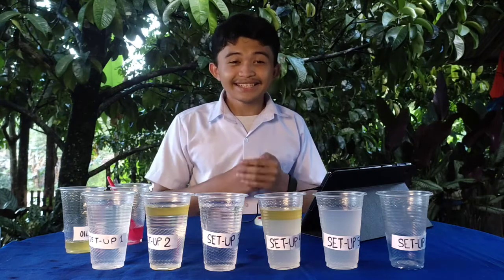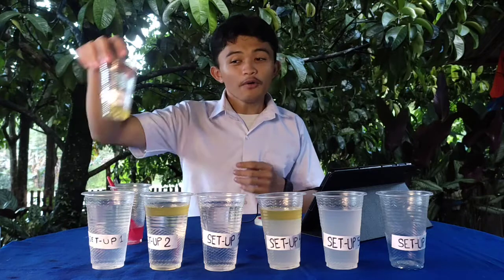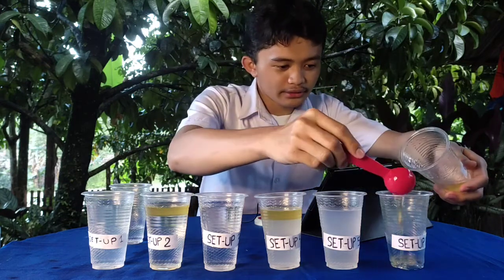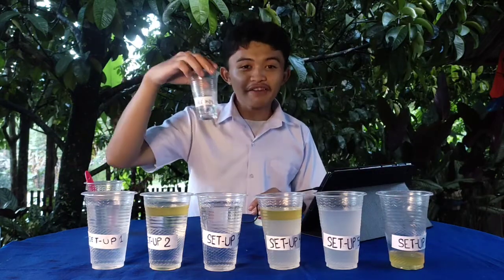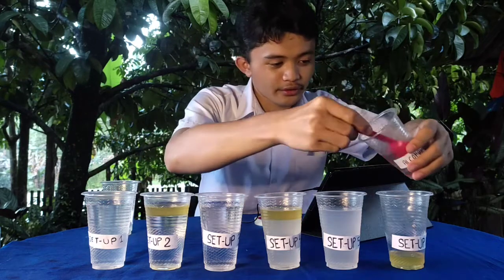And lastly, let's go to our setup number 6. Let's add five tablespoons of oil. One. Then let's add five tablespoons of alcohol. One.